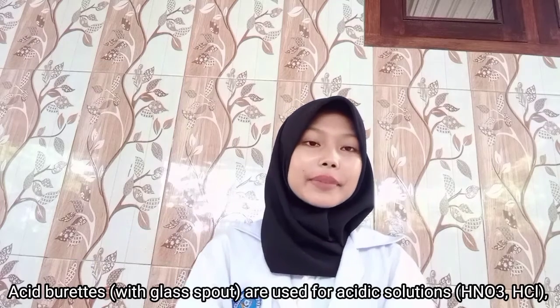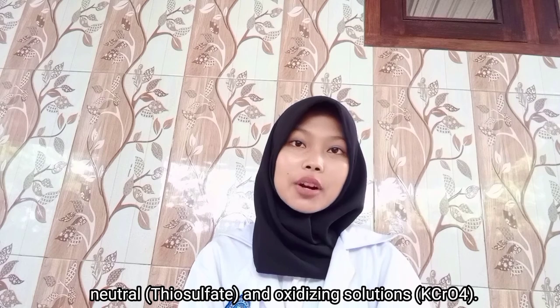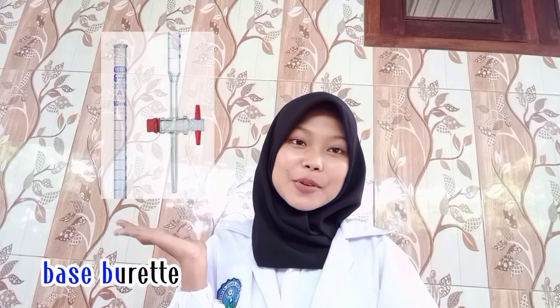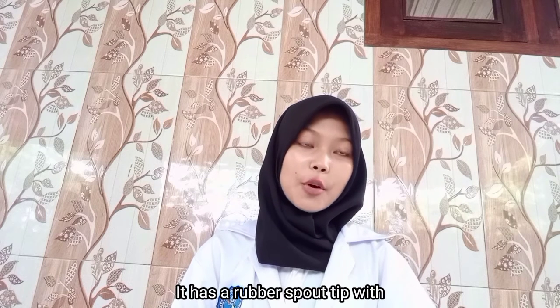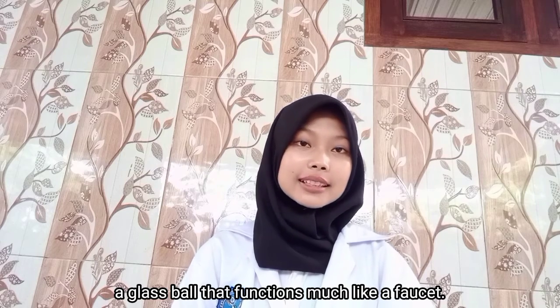1. Acid burettes. Acid burettes are used for acidic solutions, and oxidizing solutions. 2. Base burettes. Base burettes are used for alkaline solutions. It has a rubber spout tip with a glass ball that functions much like a faucet.